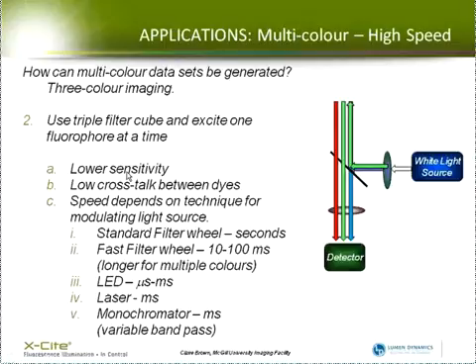And basically you're going to lower your sensitivity, and the best example is if this mirror has to reflect a green light source in order to excite your red dye, then some of your green fluorescence coming back to the detector is also going to be reflected by this mirror off this way and won't be detected. So you will lose sensitivity, but you gain speed.